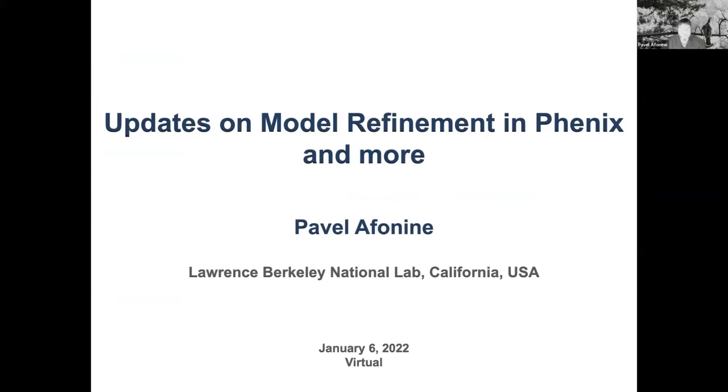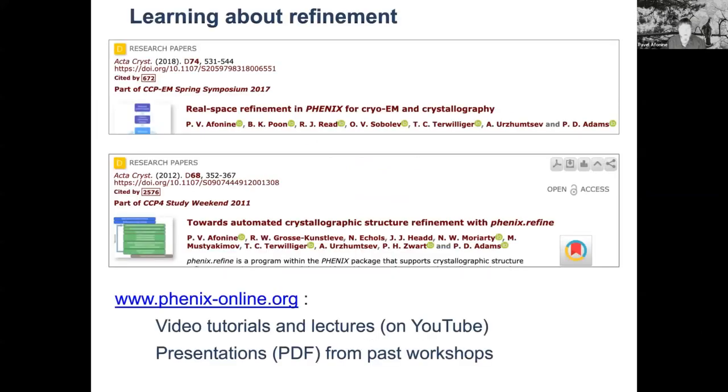So really, I do have 15 minutes, and you can't really say much about refinement in 15 minutes. Really, it's a topic for a day lecture. So what I'm going to do is provide some highlights and recent developments in Phenix, and some of them are particularly related to refinement. I'm not going to go into any great details about refinement, but I'll point you to resources which you can follow and learn yourself about refinement.